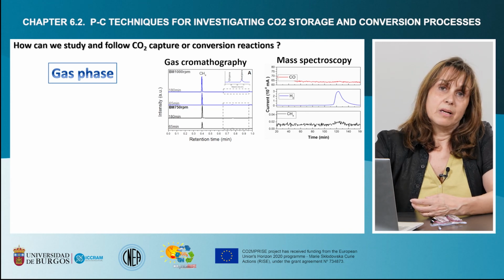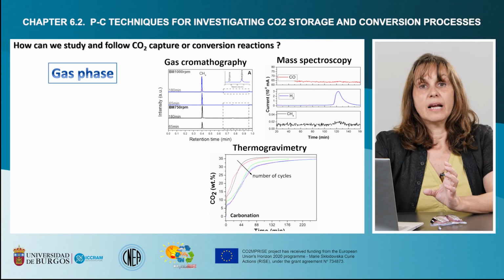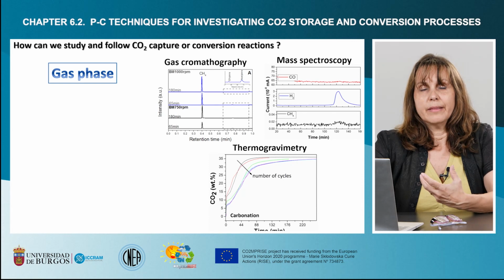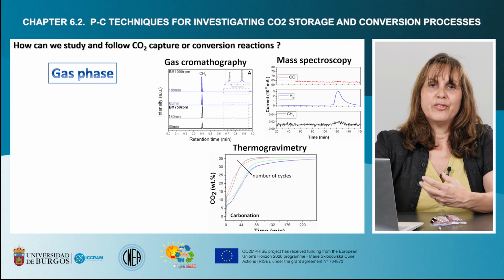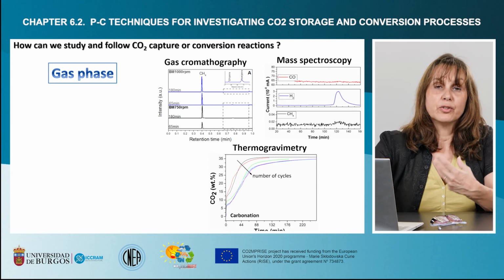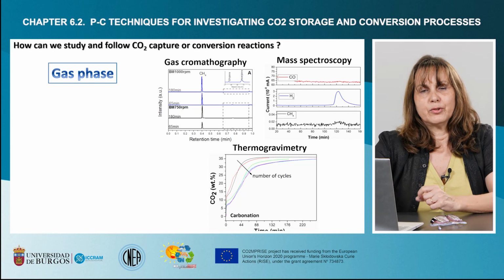Also, in particular for the carbon dioxide capture reaction, it's important to follow the change of the mass in the solid during the incorporation of the carbon dioxide with the temperature.